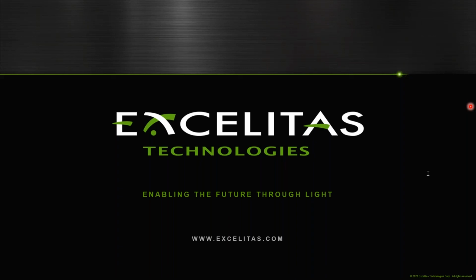What is the lifetime for LED light sources? So the LEDs themselves, people say they can go between 50,000 and 60,000. But once you integrate them into a system such as ours, again, depending on the unit, it's between 15,000 and 25,000 hours, which is a lot. And that is on time, because you're turning them on and off as much as you'd like. So it's not like a lamp when it's on all the time.